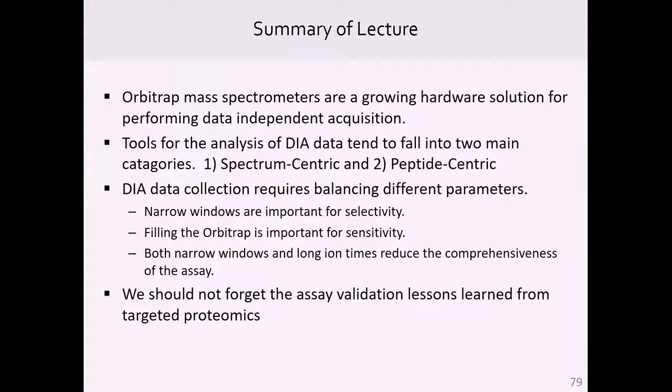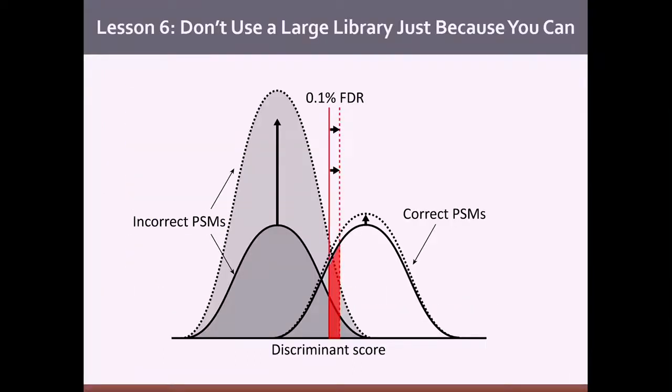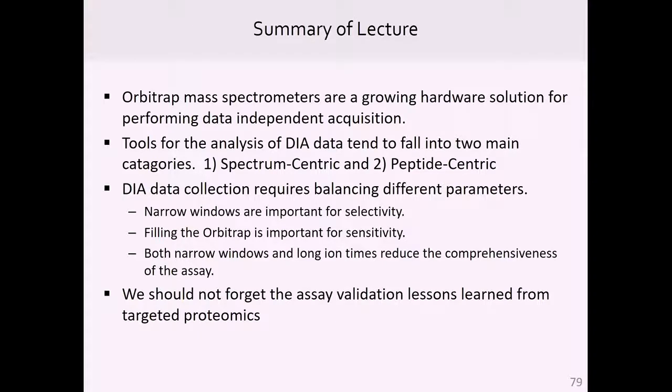I'm interested in your LOD, LoQ slide between MS1 and the different windows. You don't need to go back, but we also see this strongly, more sensitivity in MS2, and we also see when we shrink the windows that we get better selectivity and you identify more peptides. So I'm interested in the difference between the instruments. On a QTOF, this can be explained mostly in terms of selectivity, and you also pointed to selectivity. We also talked a bit about this yesterday. So on the Orbitrap, do you think there's a strong effect because you're shrinking the window, the fraction of a given target analyte is more of the ion current that you're getting? Is there a strong effect of this as well?